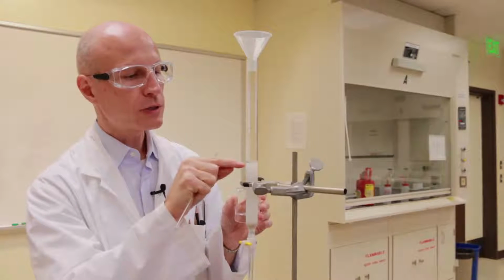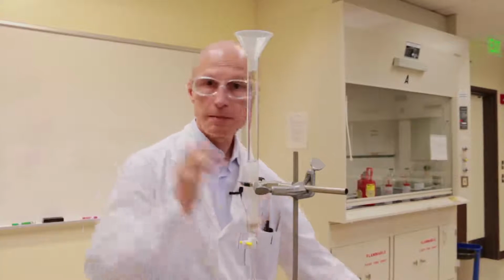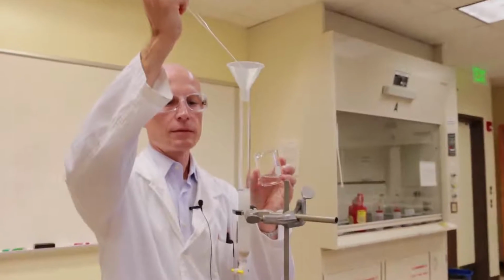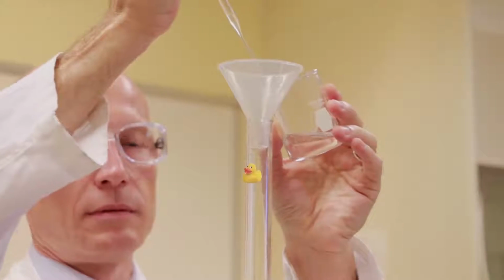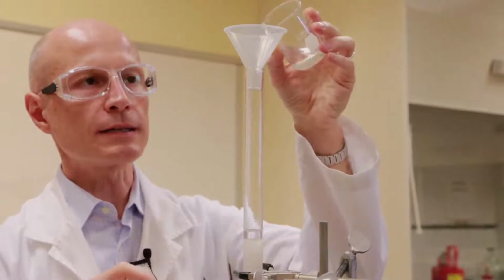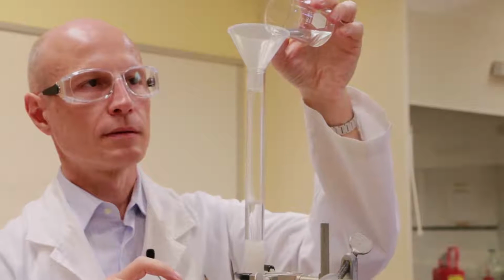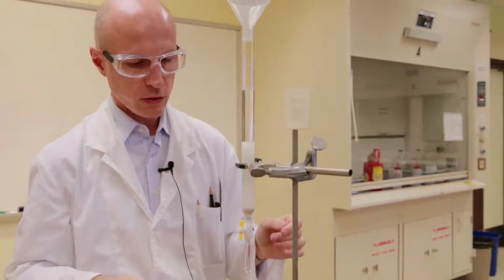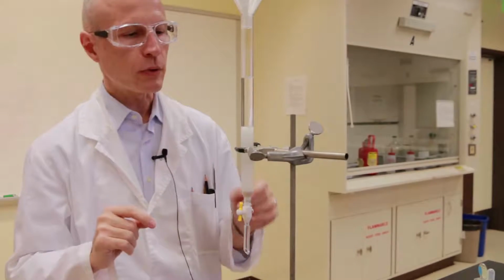It is extremely important not to disturb the surface of the silica gel when you are pouring the solvent. So at the very beginning you can use a pipette and add solvent very slowly. And then when you have enough solvent to buffer the fall, you can add a little faster. You reopen the stopcock and you let all this solvent go through again. Make sure you stop before the surface of the silica gel, because it's very important that the silica gel never goes dry.